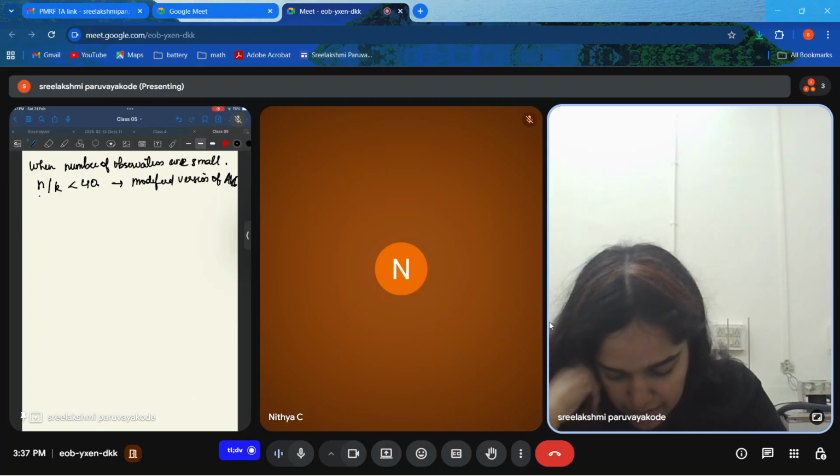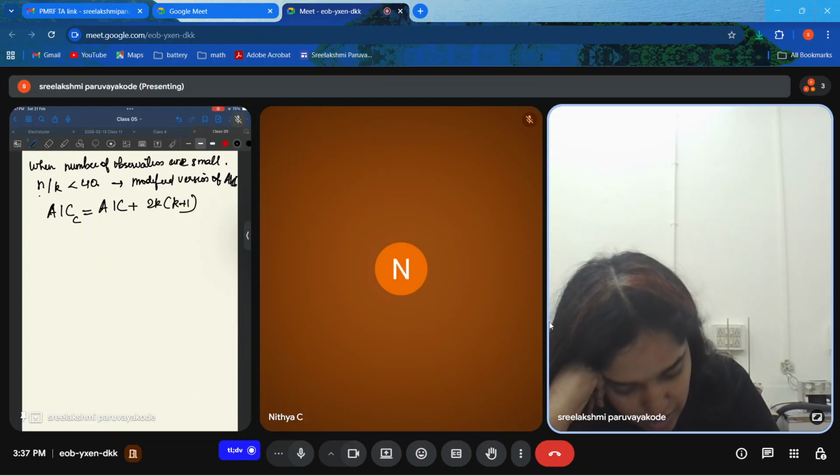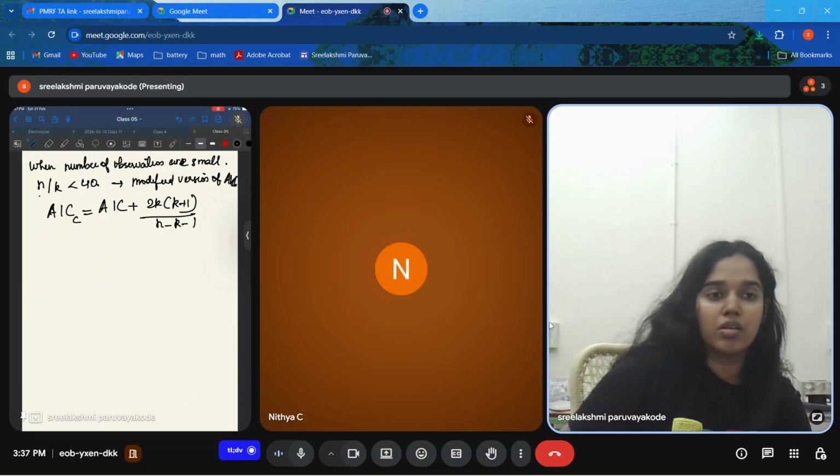This can be written as AIC corrected equal to AIC plus 2k into k plus 1 by n minus k minus 1. So this is just the information.